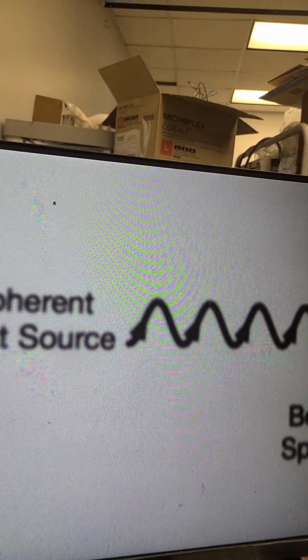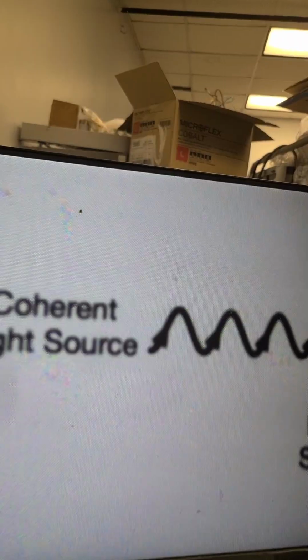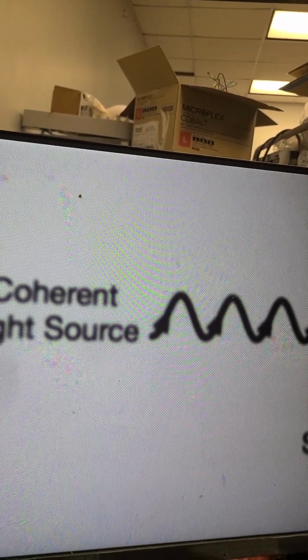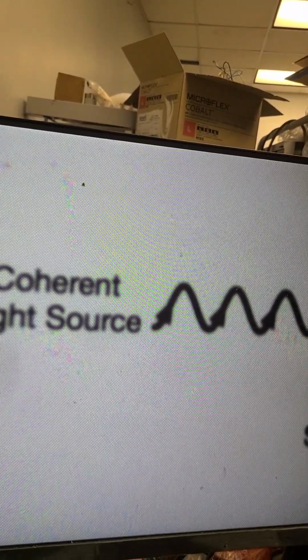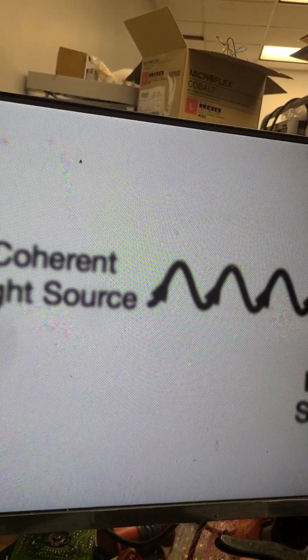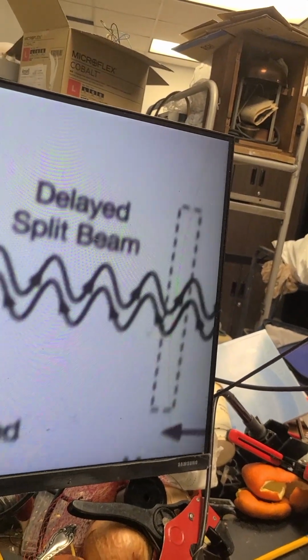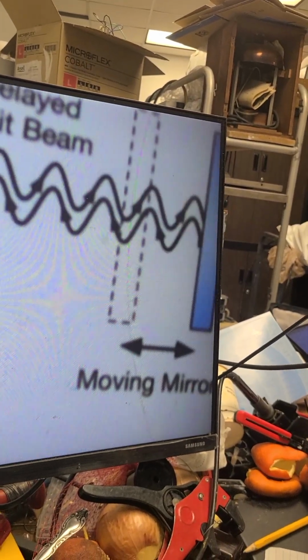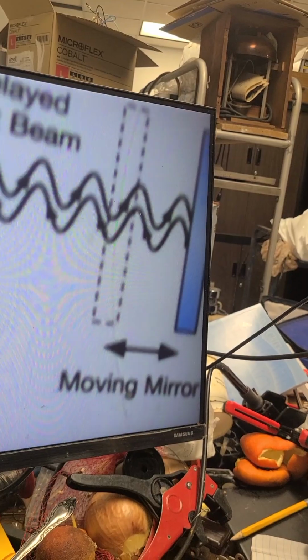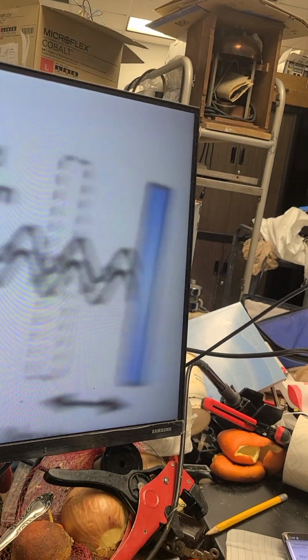So in other words, you don't see too many FT visible instruments, because the wavelength of visible light is just into a range that's kind of out of our reach in terms of moving a mirror. The amount of movement here would just be too small. You go through too many wavelengths to get what you see here.